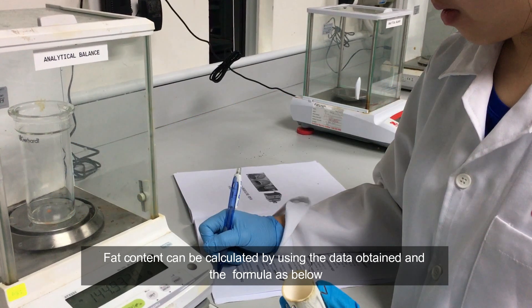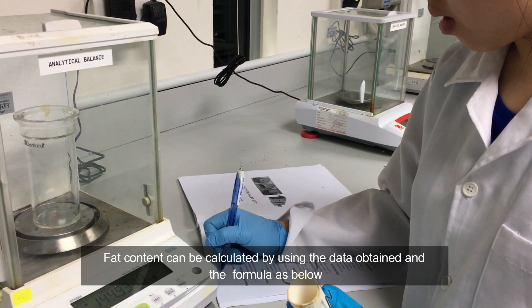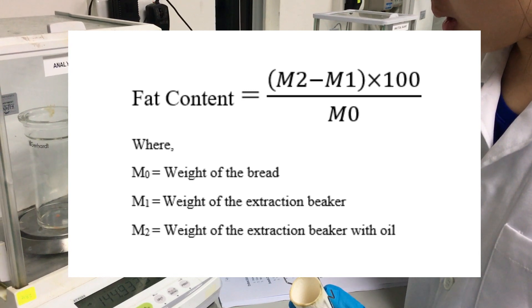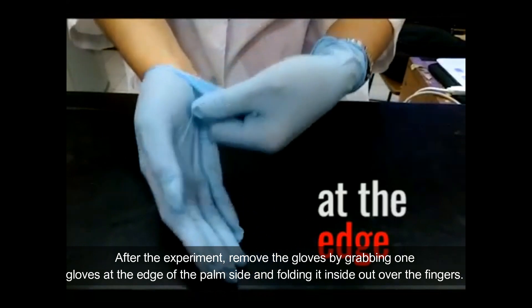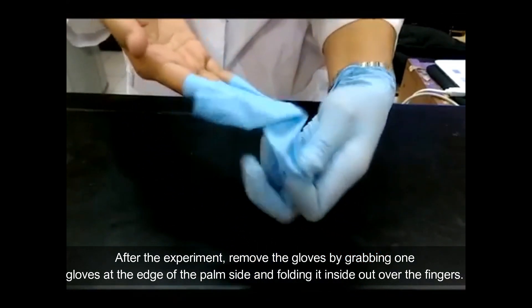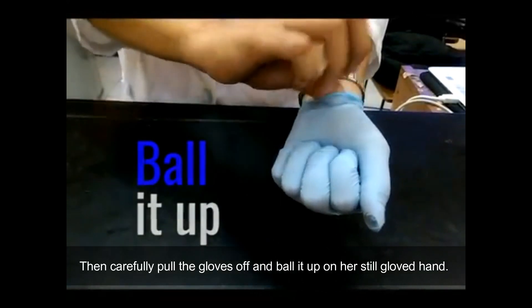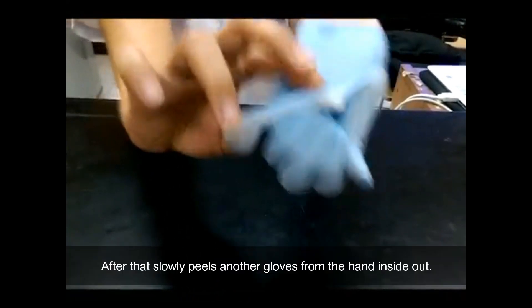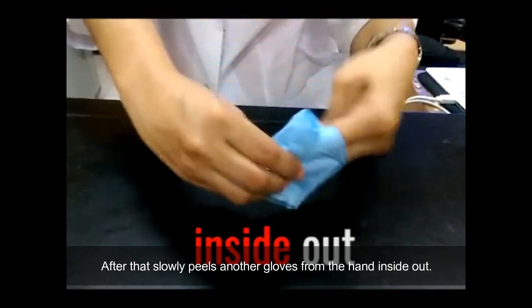Fat content can be calculated by using the data obtained and the formula as shown. After the experiment, remove the gloves by grabbing one glove at the edge of the palm side and folding it inside out over your fingers. Then, carefully pull the glove off. After that, slowly peel the other glove from the hand inside out.